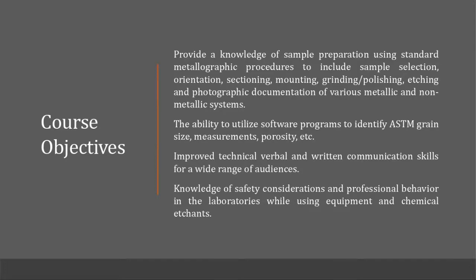And in the process of doing photographic documentation, you'll be able to take advantage of some software programs to help you identify ASTM grain size using ASTM grain size standards, performing measurements. So if you're working with coated components or you're looking at powder, then you can perform measurements using the software programs.